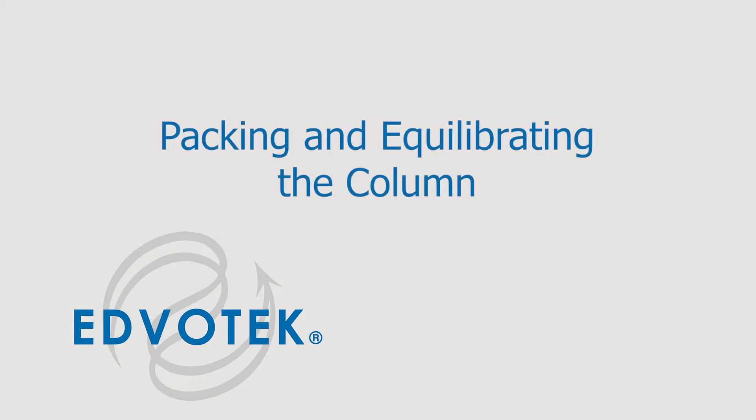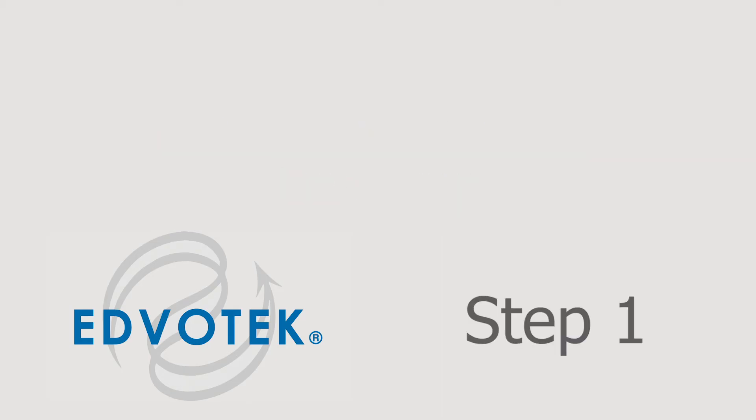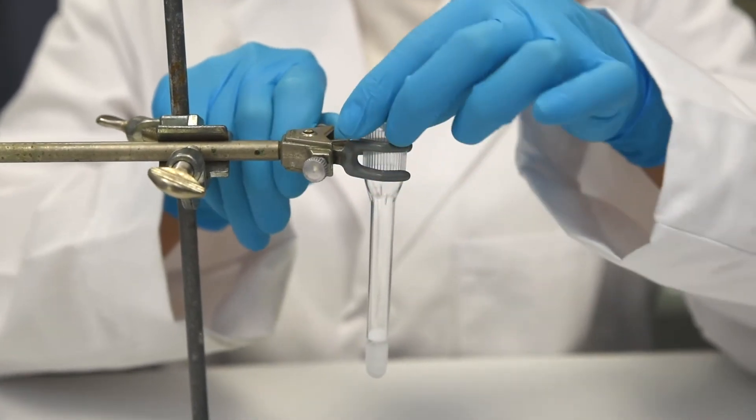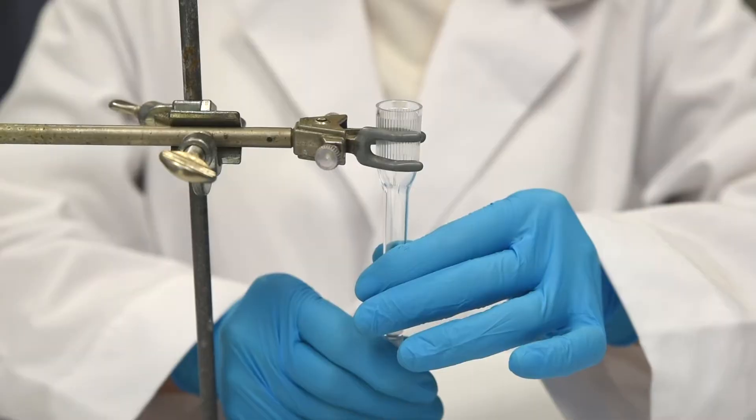Packing and equilibrating the column. Step 1: Vertically mount the column onto a ring stand. Make sure it is straight and that the cap is firmly attached to the bottom of the column.